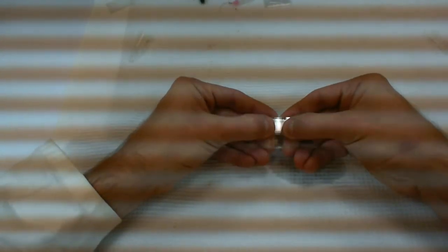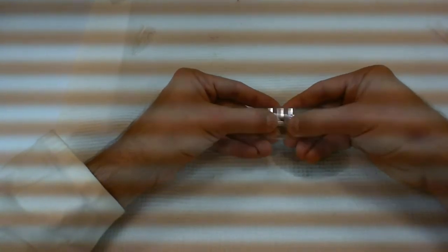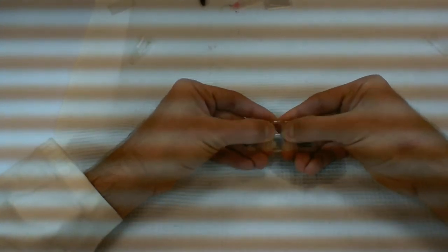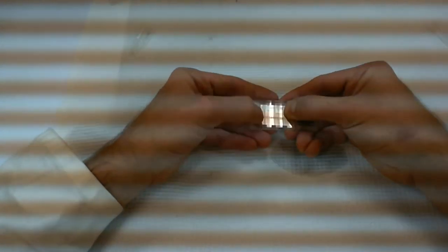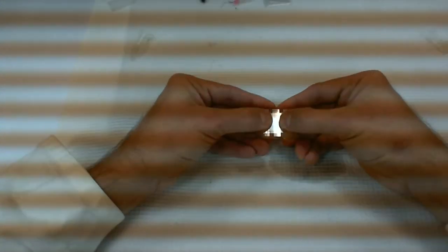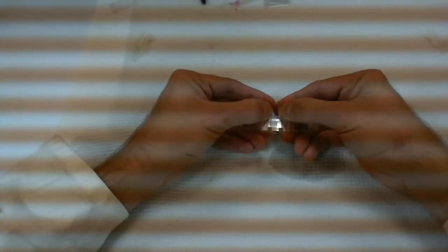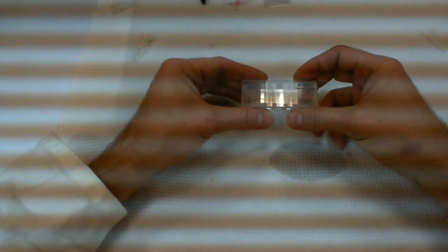And right now, on the left-hand side, it's starting to give me a bit of resistance. The right-hand side is still moving a little bit, but not a lot. Again, I'm applying a fair bit of pressure at this point. There's still a bit of movement here, so I'm going to continue. But it's starting to not want to move very much. I'm getting to a point where this is relatively attached. I'm going to check to see if I have Newton's rings.